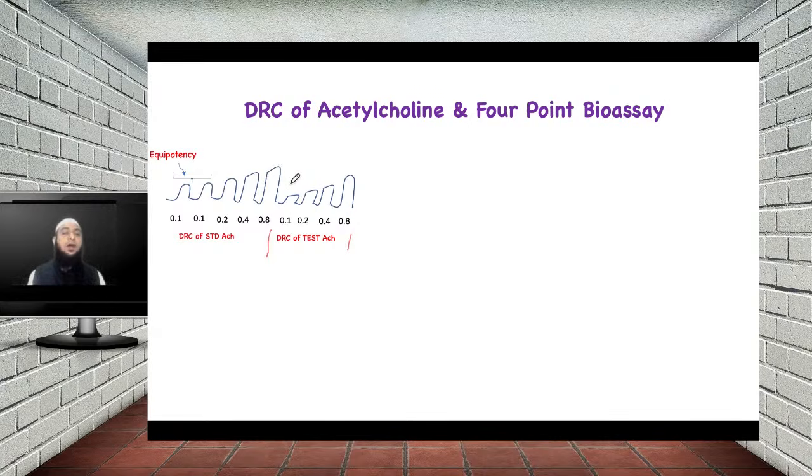So first we'll see how to select the S1 and the S2. In case of S1 and S2, the criterion for selection is that the doses should have the ratio of 1:2. Means if you select S1 as 0.1 ml, that is 10 mm, then S2 must be 14 mm, right? And since it is giving good gradation, you can see S1 having 10 mm of height, S2 having 14 mm of height, and there is good gradation between S1 and S2.